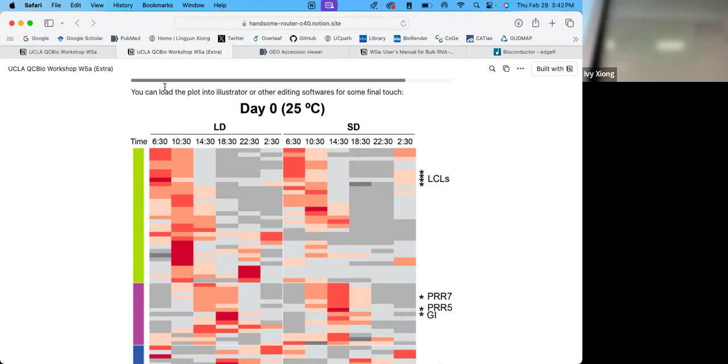So then, this is modules exporting from. Yeah, that's hashed out, so oh, yeah, we're not doing that. Yeah, what is that? Oh, and then so it's going to star alignments. Yeah. So you have this folder, you can come, not in this, actually.